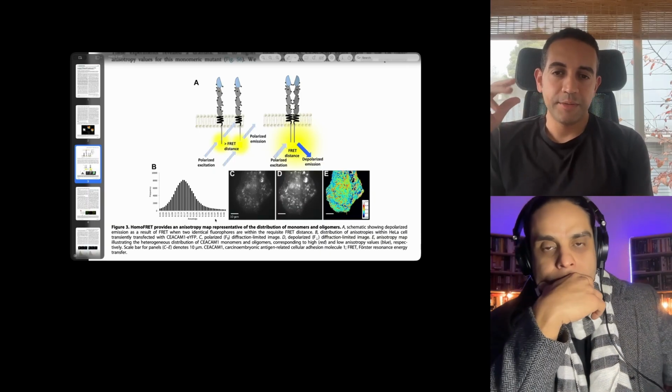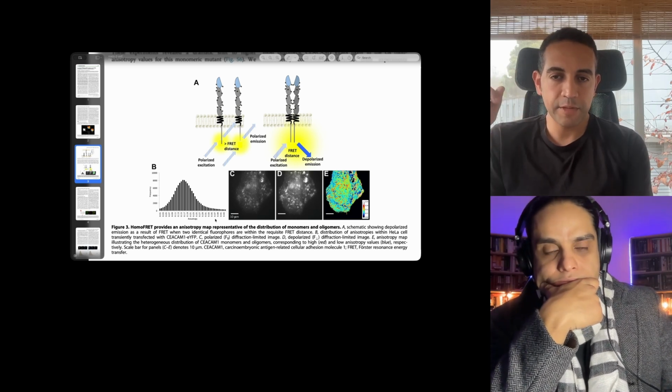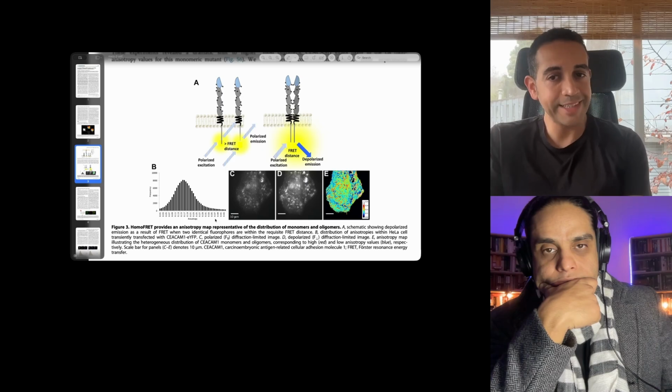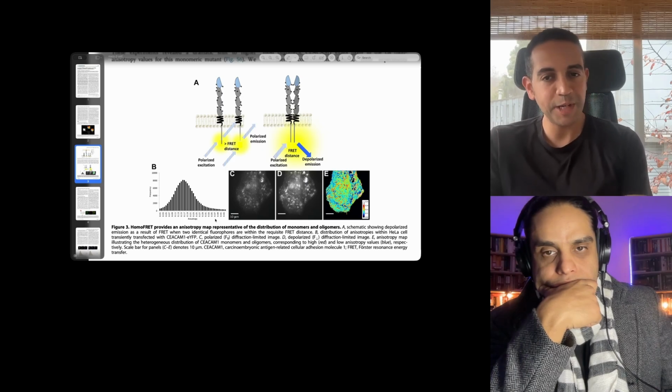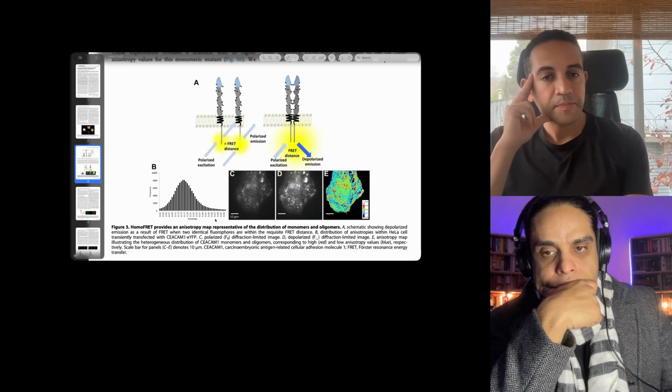So you basically have to have a design, a setup that allows those two cameras to always be kind of very well aligned. And the reason I'm saying kind of and not very well aligned is that you still have also to do some registration, some image analysis to register the two images to one another to make sure that the pixels for which you're calculating a ratio are the exact same ones.